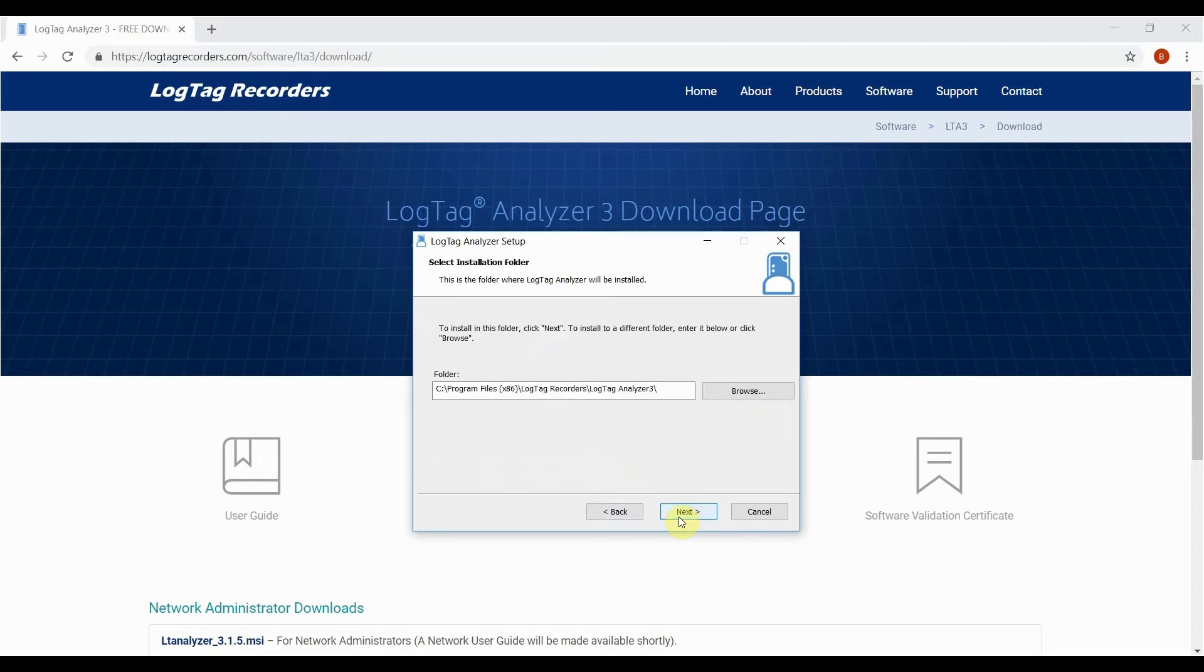Change where you want to install the software or leave it to install LogTag Analyzer to the default location and click next.